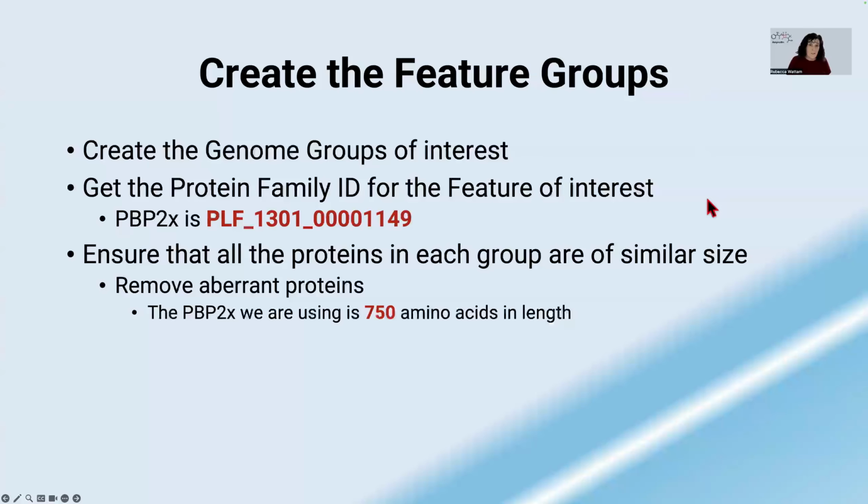For this particular job, we're going to use feature groups. And I don't want to step you through creating the feature groups again. They're the same ones that I created for the multiple sequence alignment series. And you should go back and watch that if you have any questions.